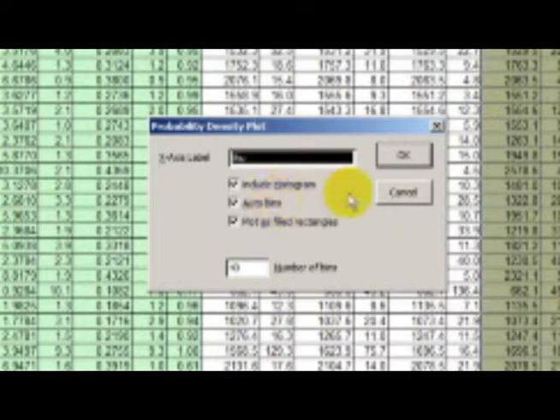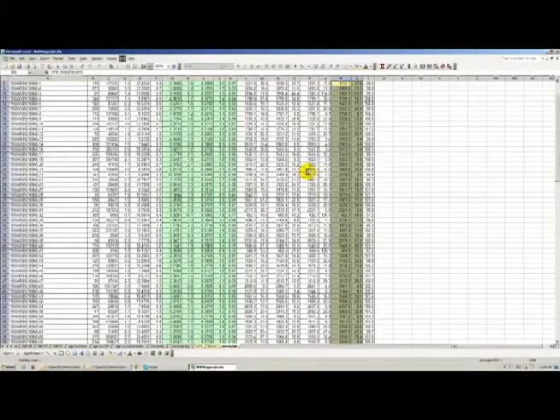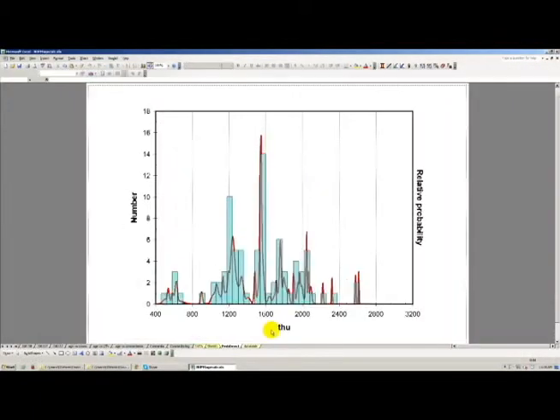It doesn't really matter what you select here. You can click OK again. We just want to take a really quick look at the data. Okay, so what you can see from this plot is that there aren't many grains that are around that age, that is the threshold around 900 Ma. But there's this one grain, so there's nothing at around 800.